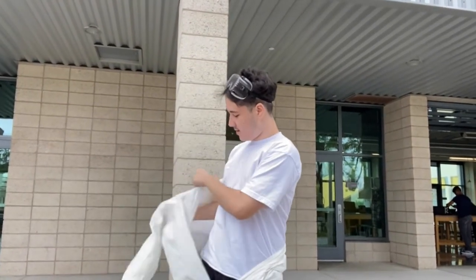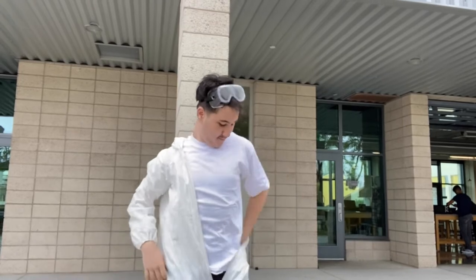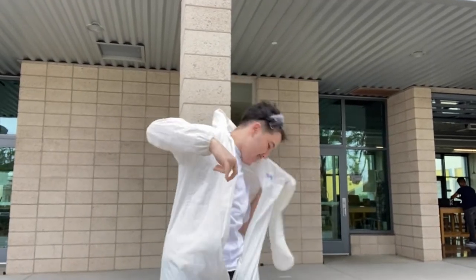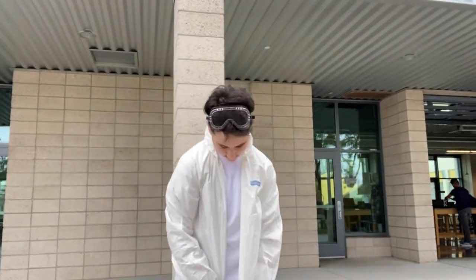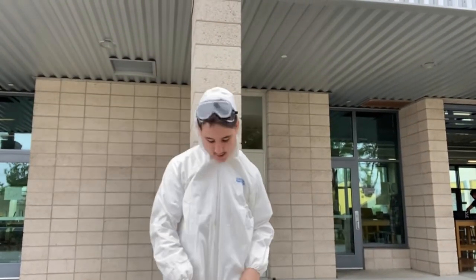Then next, put your arms in like a jacket. Next, zip it up. Put it on. Even protect the shoes.